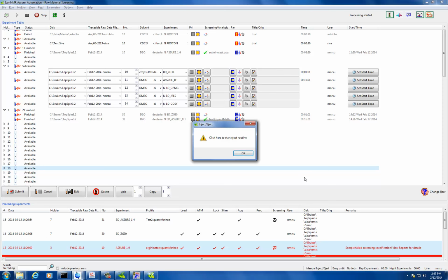The only thing about that is the juice screener is in Germany, so you send the sample and then they give you the report. I see. I wonder if they run into some problems with cranberry juice samples for that reason. Yeah, there's so much variation.